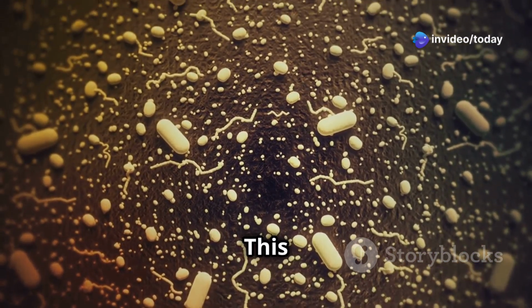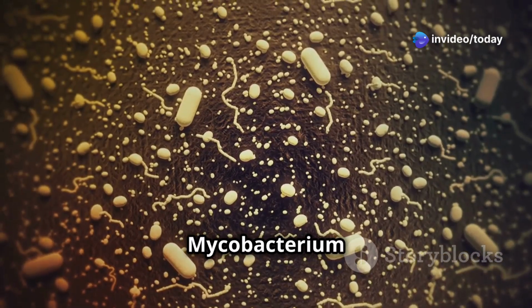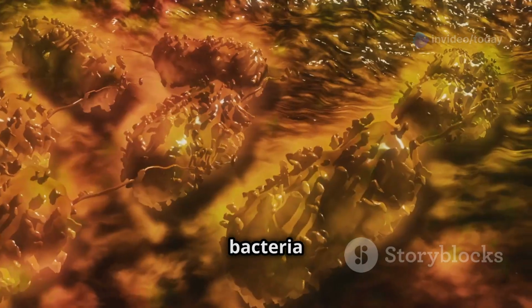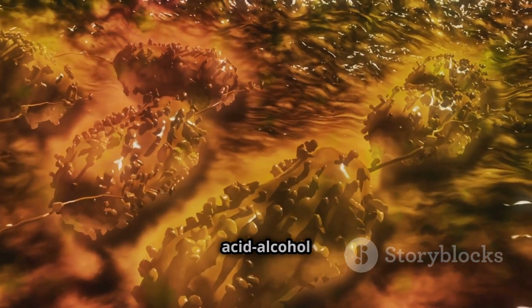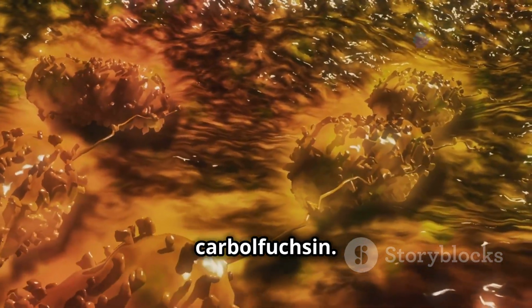Acid-Fast stain. This technique is used to identify bacteria with a waxy cell wall, such as Mycobacterium tuberculosis. These bacteria resist decolorization with acid alcohol and retain the primary stain, carbolfuchsin.